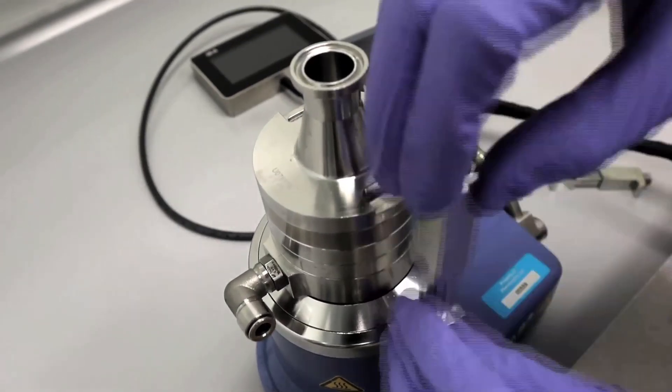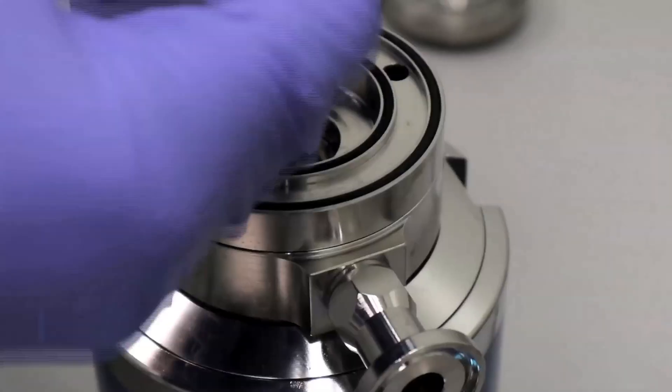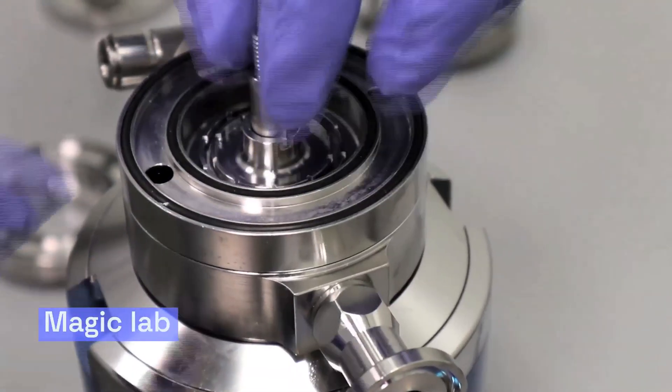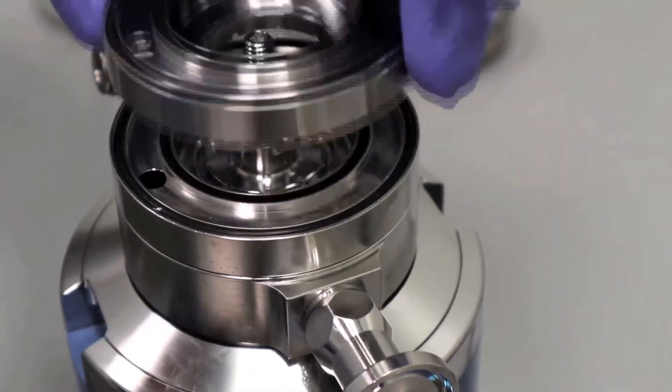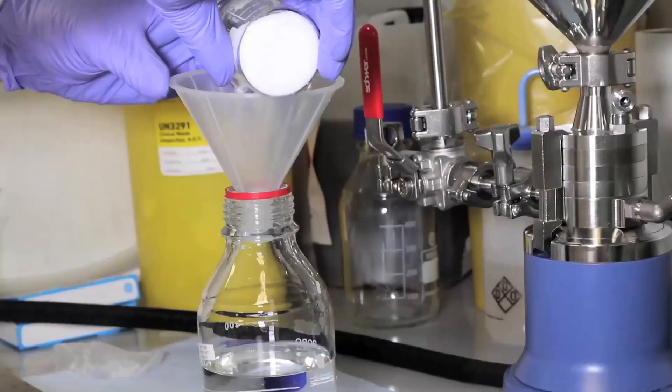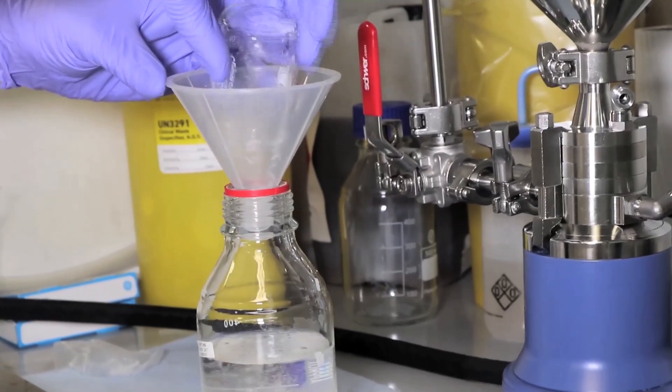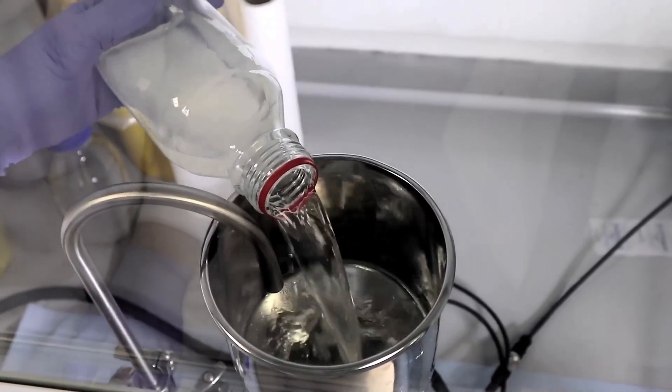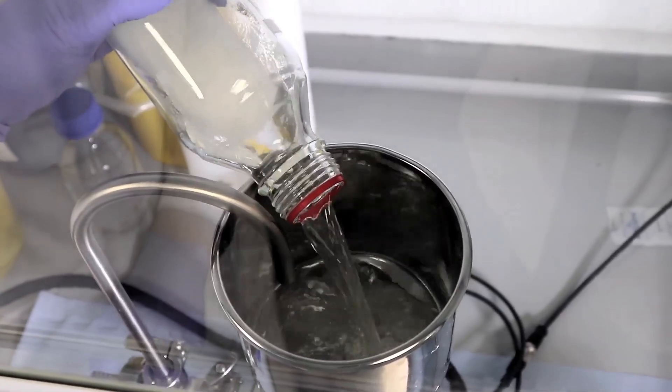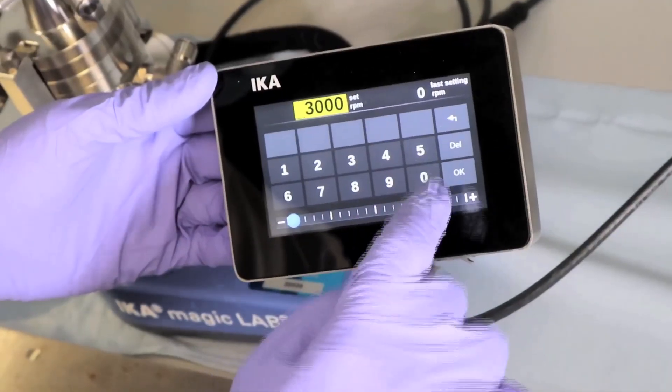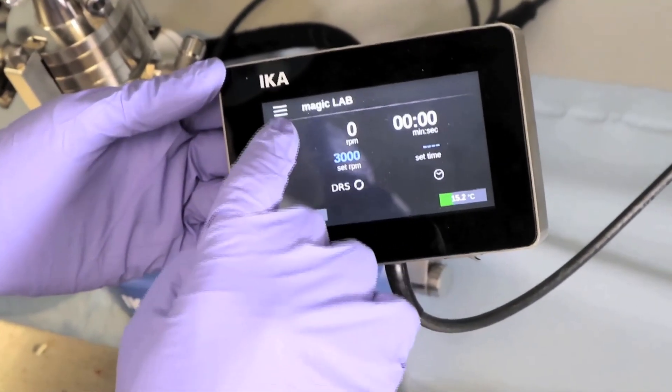Wet milling is one of the tools that we can use to engineer materials with targeted and controlled particle size distributions. This is important for ensuring your material has the correct bulk properties for downstream processes such as filtration, handleability and tableting. It also ensures the material remains within specification to meet consistent desirable dissolution profiles.